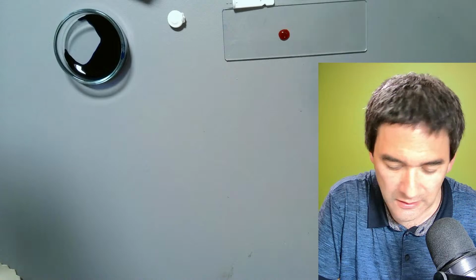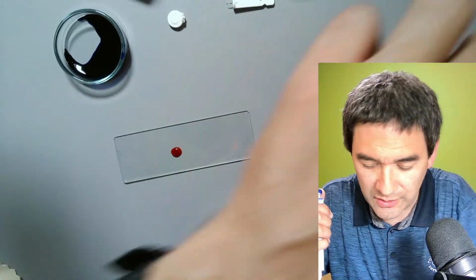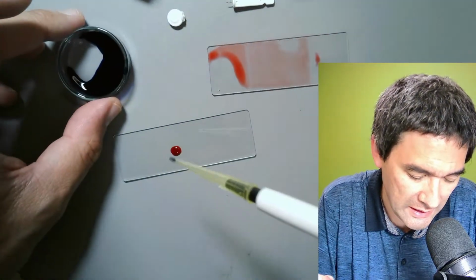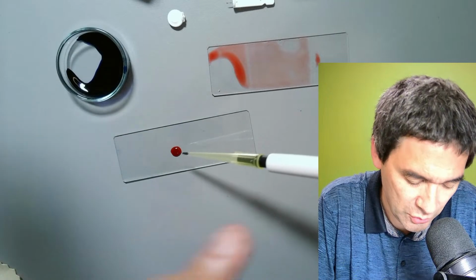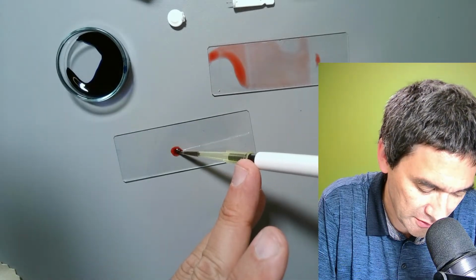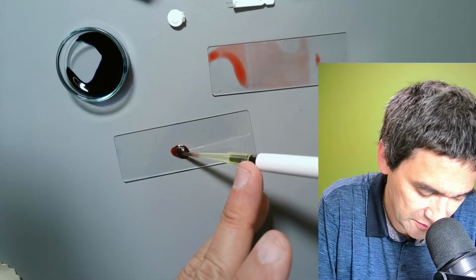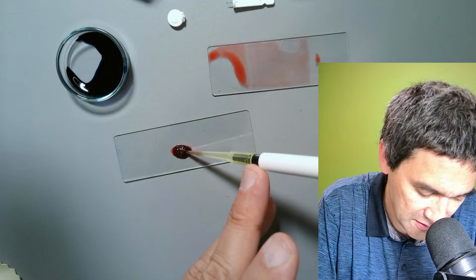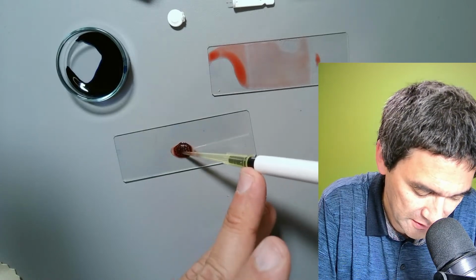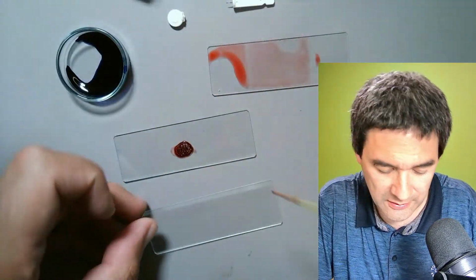It might be still a little too dense. So what I'm going to do now is I'm going to use this here, and I'm going to add a little bit of this ink, not too much because I know that it's quite strong, and I do not want to make it too dark. So I'm going to mix this again. I know if you want to do this properly, you probably have to get the correct quantity of each and all these things, right? I'm not doing that.